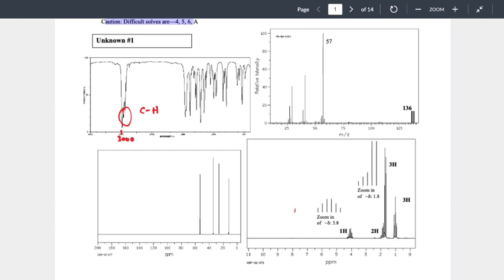So when you said CH, you didn't just say CH, you said CH sp3. You're saying you know the hybridization of the carbon. Why? You've memorized that already from looking at either a table or other structures of CH sp3s to say that's what that signal looks like. Okay? That comes with experience.